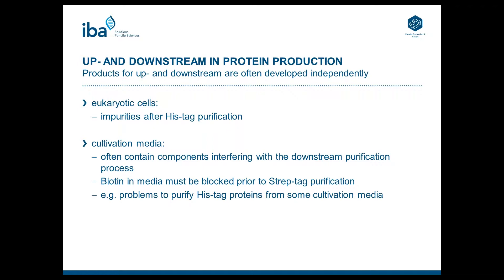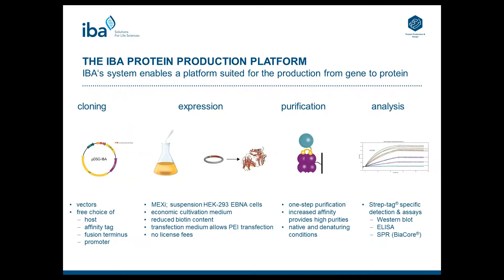Much worse is the problem when it comes to His-tag purification. We know that in many mammalian media you cannot purify His-tag proteins efficiently from mammalian supernatants. One reason is that components in many mammalian media interfere with the His-tag purification process. Furthermore, you often have impurities after His-tag purification because eukaryotic cells contain more host cell proteins with histidine residues, making purification more challenging. Providers often suggest a dialysis step or buffer exchange, but this costs much time and money.